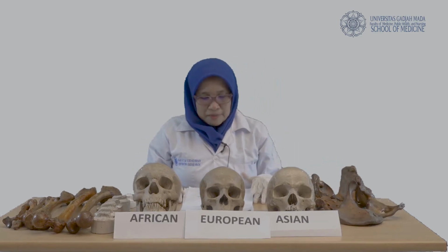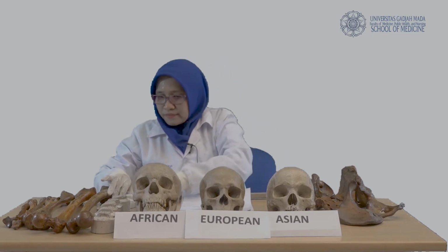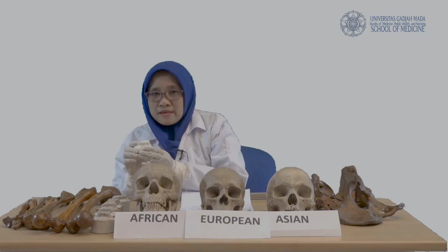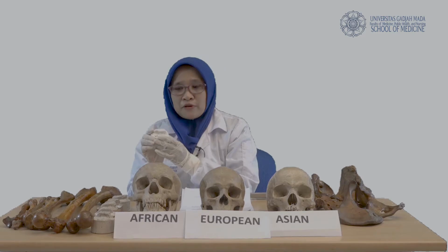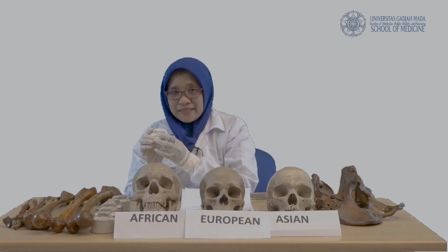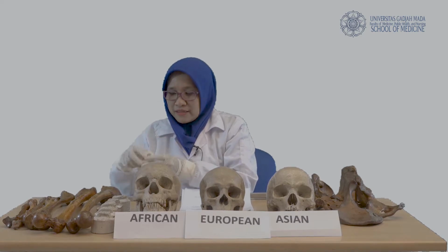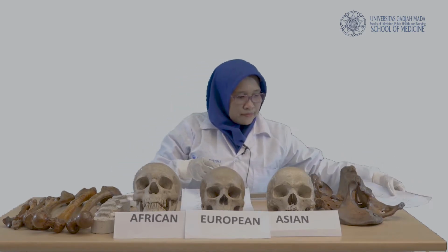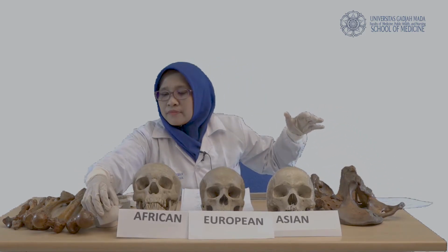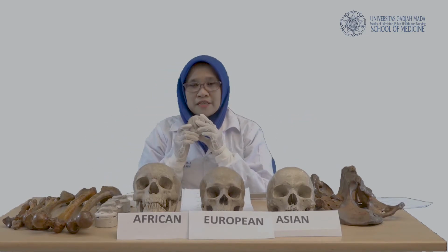Now move on to the next step, which is to determine the age of the pubic symphysis cast. This is the cast. We use the Suchey-Brooks method. The Suchey-Brooks method consists of 6 phases, and each phase has its characteristics. Starting from number 1, this is the pubic symphysis phase 1 of the Suchey-Brooks method.